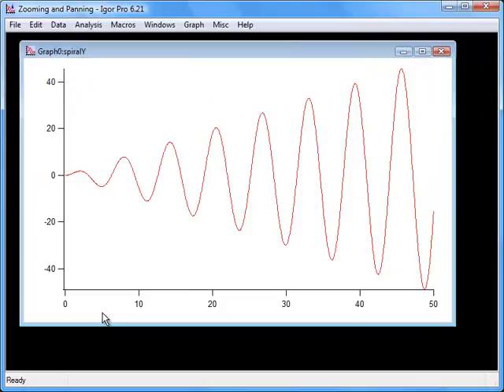Note that the X axis goes from 0 to 50. This is because the Set Scale command, which we executed earlier in a previous video, set the X scaling property of Spiral Y, which tells Igor how to compute an X value from a point number. Choosing Calculated from the X Waves list graphs the Spiral Y data values versus these calculated X values.